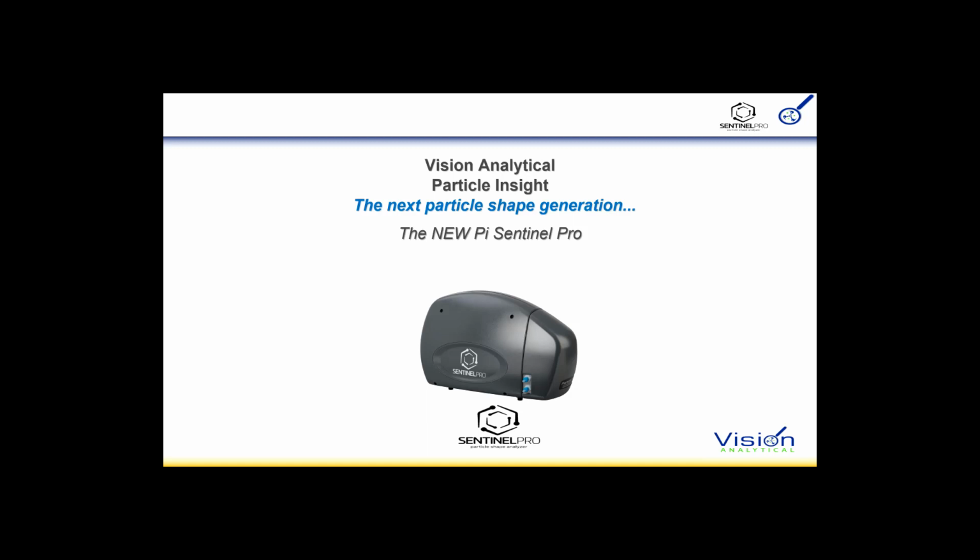There's a new interface that uses Windows 10, of course, but it's a Windows 10 touchscreen, so you can run the Particle Insight and do reporting with the monitor or the mouse as you see fit.